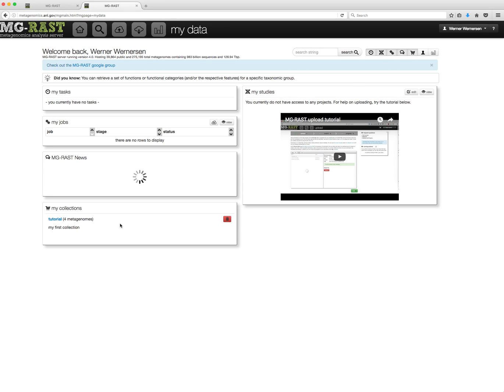Here you have the option to delete collections, but you can also view them in detail. Click on the collection name to do so.